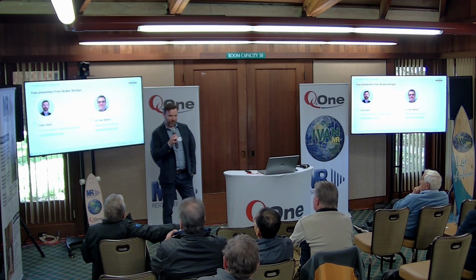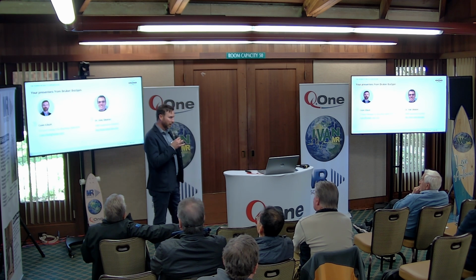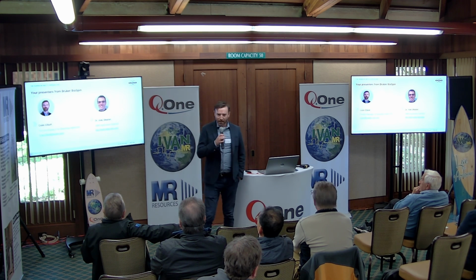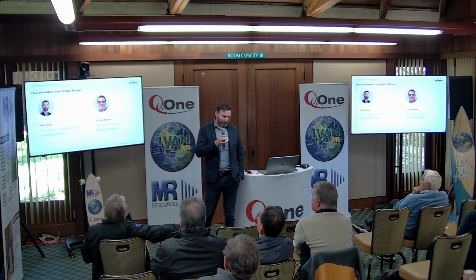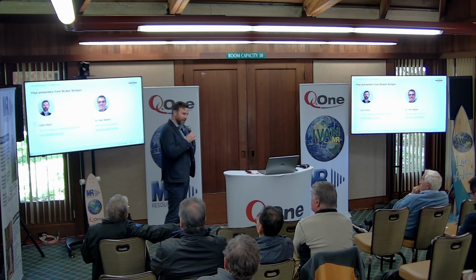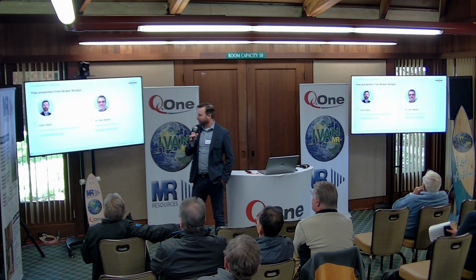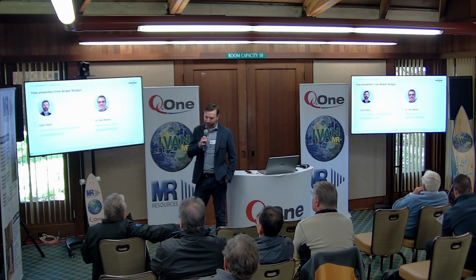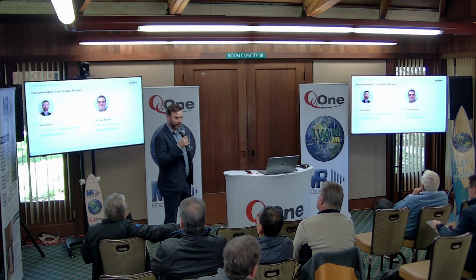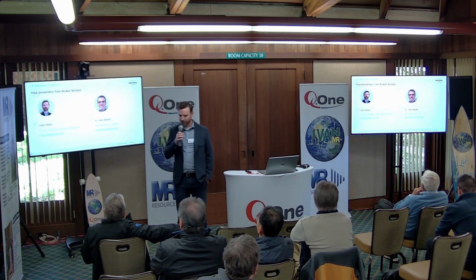And we were developing a different type of benchtop spectrometer, which was EPR or ESR. And this product became the micro ESR, which maybe some of you have come across. To cut a long story short, the micro ESR and myself joined Bruker about 6 or 7 years ago. And I stayed mostly in the EPR domain until last year when I was given the opportunity to lead the entire benchtop program. So the products include the ESR 5000, the mini spec, which is our time domain NMR, and of course, the Fourier 80, which is the subject of today's talk.